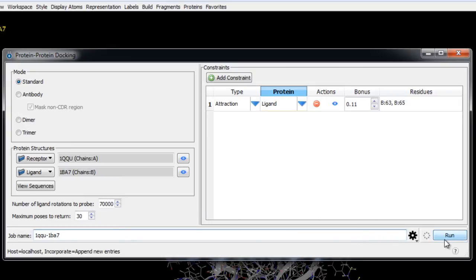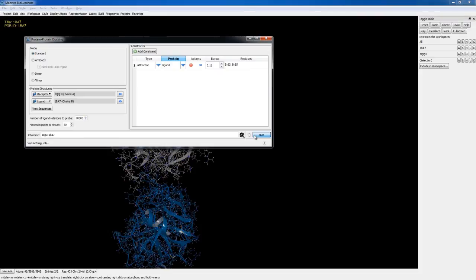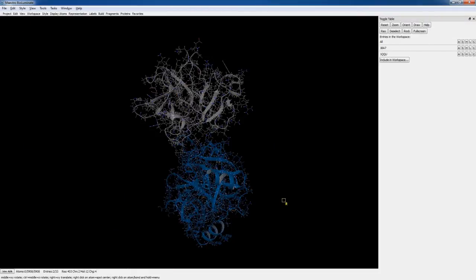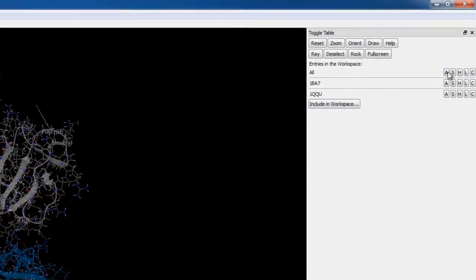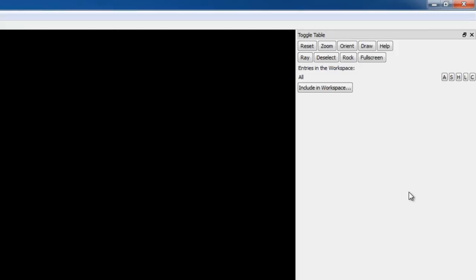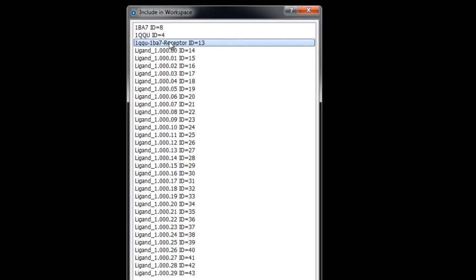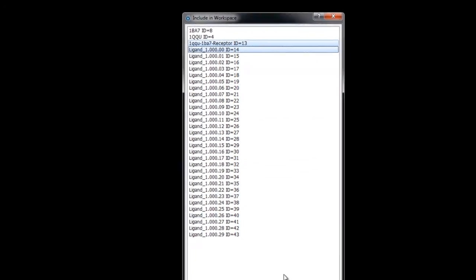Once we have everything set up we can rename the job and then click Run. The job can take up to four hours on a single processor. Once the job finishes, the results are incorporated into the project. We'll click the all row in the toggle table and choose remove everything from workspace, then click include in workspace, select the receptor 1QQU, and select the first ranked ligand pose from 1BA7 and click OK.